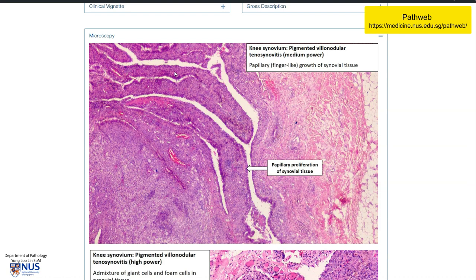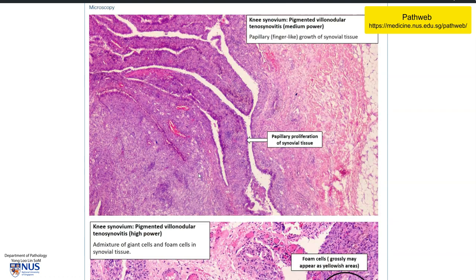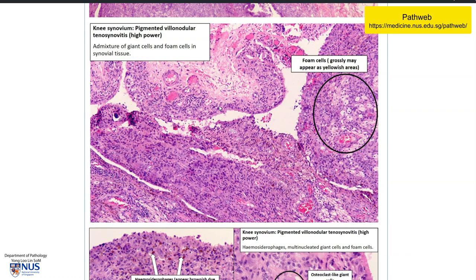This is a lower magnification view of one of the areas of these frond-like projections, and this is actually hyperplastic synovial lining. The underlying tissue has a variety of cells. Moving to a higher magnification, we can again see the hyperplastic synovial lining, and in the stroma there is a variety of cells. In this particular area we can see all these pale cells, which are foamy macrophages. Aggregates of these macrophages would give this lesion a yellowish appearance grossly.